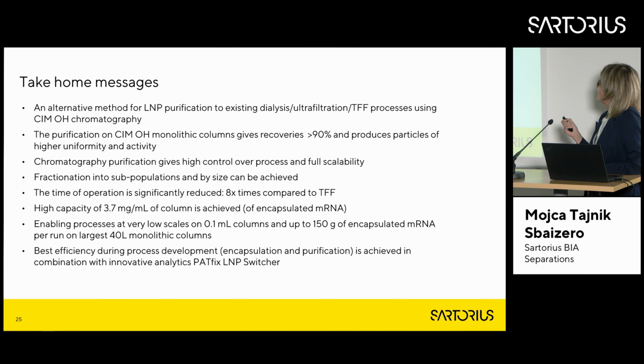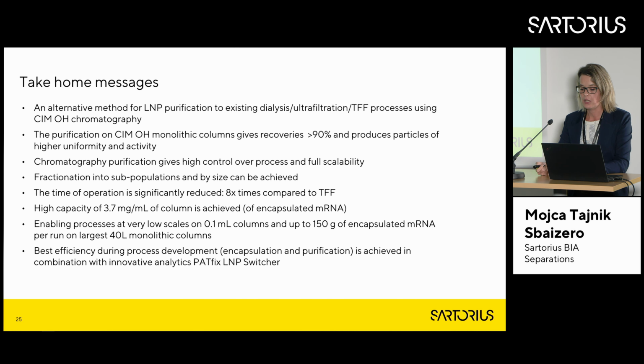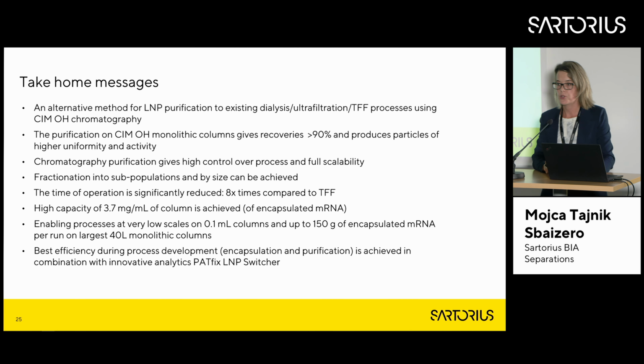We got high recovery and good uniformity of the sample and activity. This is due to the low shear force process that I was mentioning. We showed how this process is scalable, and also in these slides I showed some screening of the subpopulations, so separation can for sure also be tailored based on your specific drug product on the columns.